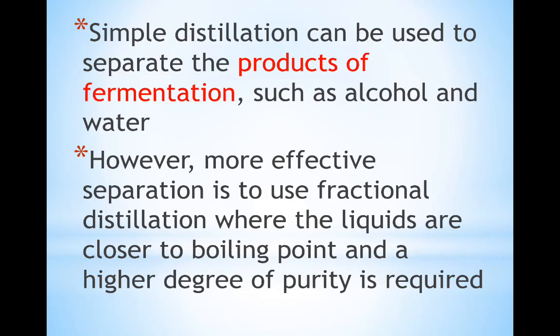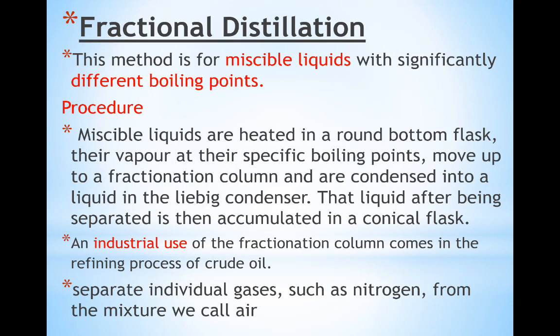Simple distillation can be used to separate the product of fermentation such as alcohol and water. However, more effective separation uses fractional distillation, where the liquids are closer in boiling point and a high degree of purity is required. Fractional distillation. This method is for miscible liquids with significantly different boiling points.